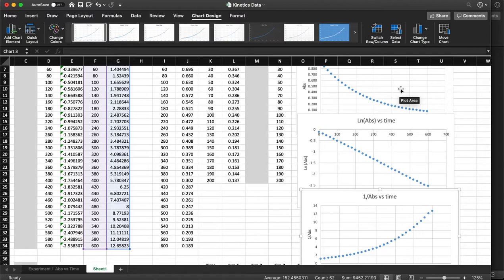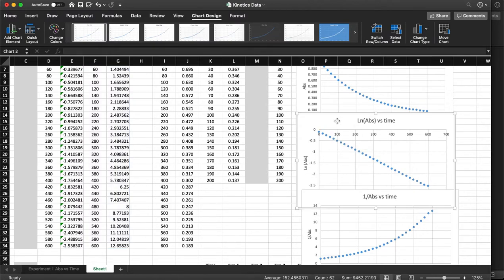And then in a minute, we're going to start up on our second segment where we have, I think, 5 different experiments worth of data that are all included here. We're going to take a look at calculating rate constants from these plots. Now that we know the reaction is first order, we're going to make this plot for all of our 5 experiments and then calculate our rate constant for those reactions from that plot. And we're going to go over how to do that as our next part.